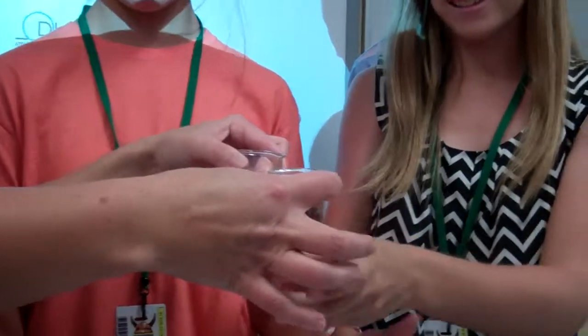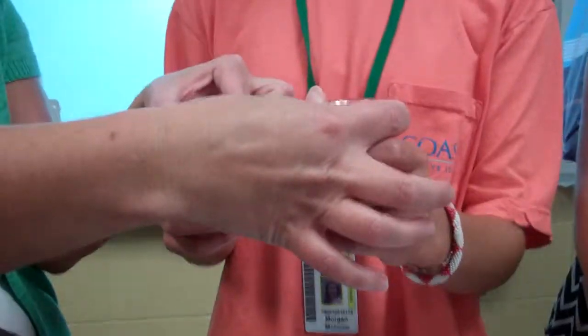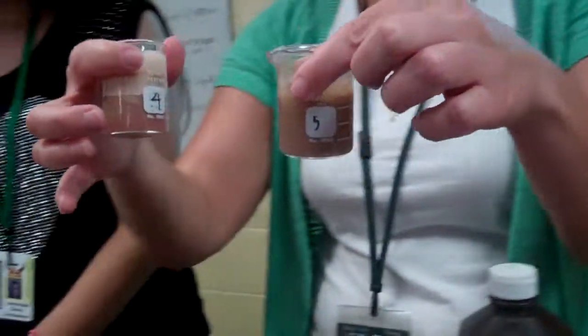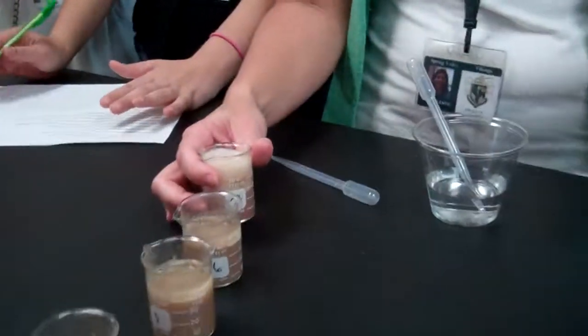I really feel it. A little bit. Yeah, it's not going to be a huge difference. You feel it now? A little bit. Alright, so it's not hot. It's not cold. Right, it's not hot. But what do you call a reaction that releases heat?